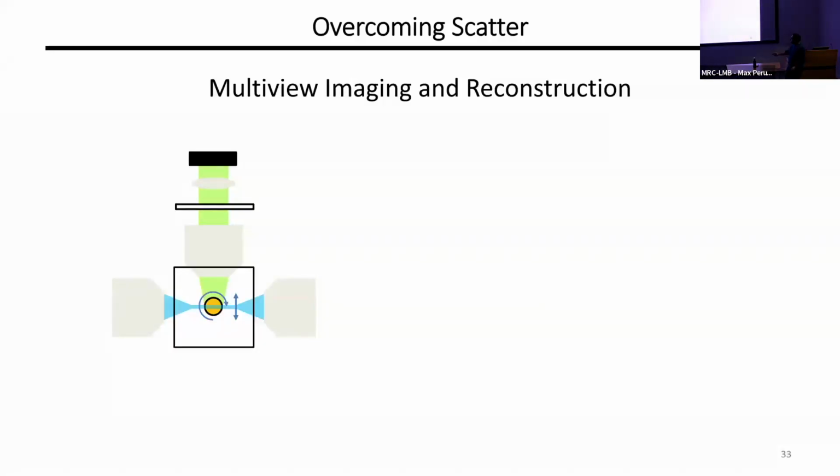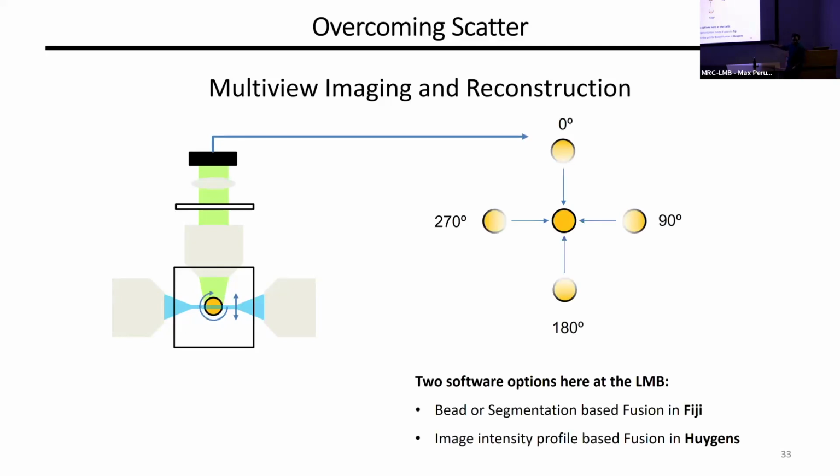The idea is that you can actually, using that way of mounting a sample that I showed you before, rotate that cylinder, rotate that tube, and have the acquisition being done through different angles there. So it means that you can have acquisition being done here, and then the sample rotates 90 degrees.